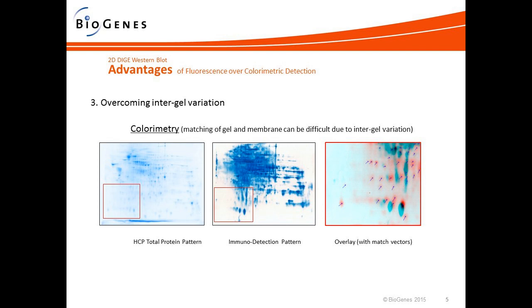You would have to choose, for example, one blot with a low amount of antigen and a low amount of antibody, and a second blot with a high amount of antigen and a high amount of antibody, to have at least 2 different intensities to be able to evaluate this properly. In fluorescence, you don't have this problem anymore because you have such a high dynamic range. You don't have a blur due to overstaining.